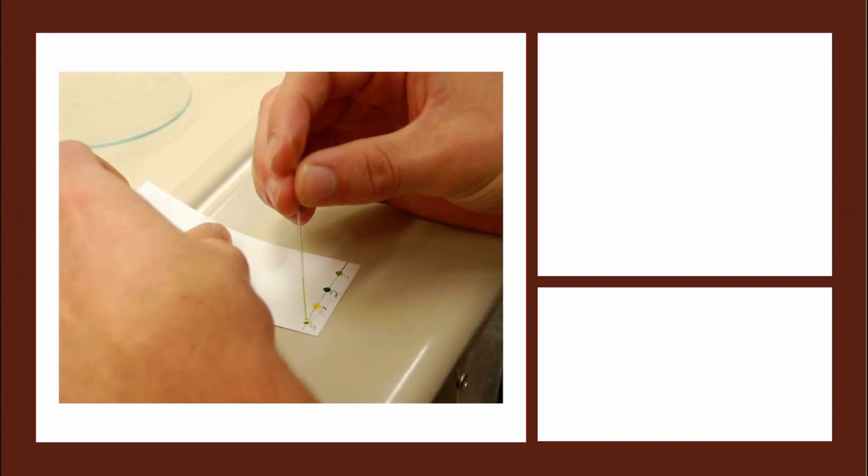dyes. In paper chromatography, you get a sheet of filter paper and you draw a line at the bottom using a pencil. This line is called the baseline or the start line. You use a pencil, not a pen, because pencil will not dissolve in the solvent, while a pen can contain dyes that can dissolve in the solvent and can affect your chromatography.